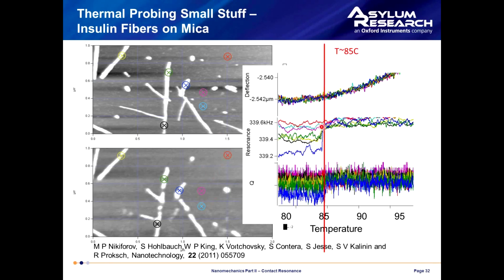Now the takeaway message from this is that at the same time we're looking at the cantilever deflection, which is analogous to a force curve measurement, and in that case there's just nothing that happens here. It's only in the contact resonance, which is so much more sensitive, that we see this jump in the behavior.